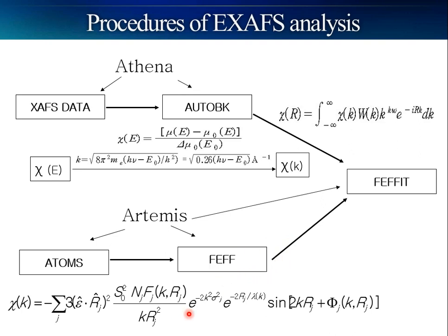Okay, so during the data fit, you have to use this formula.